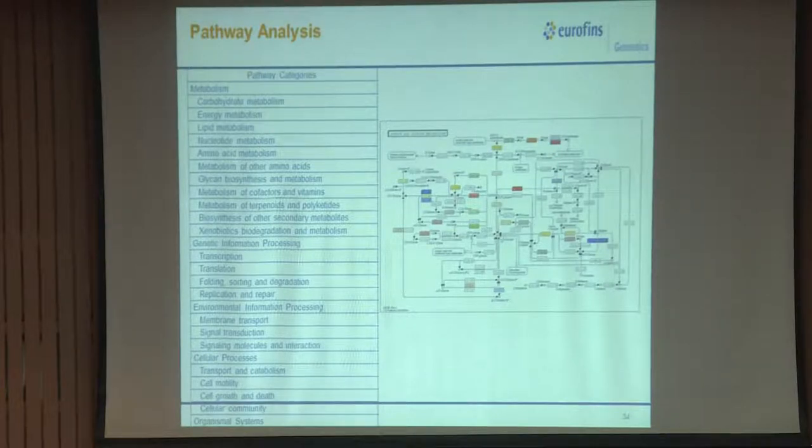In these categories again we have various pathways; in carbohydrate we have glycolysis and so on. Each and every gene, which pathway it falls in, that information can be found, including basic pathways like glycolysis, Krebs cycle and all. All those genes we can identify using the KEGG database, and the pathways look like this. Wherever you have mapping, you can see different colors, and where you do not have it, you might see white. You can play around with these databases.